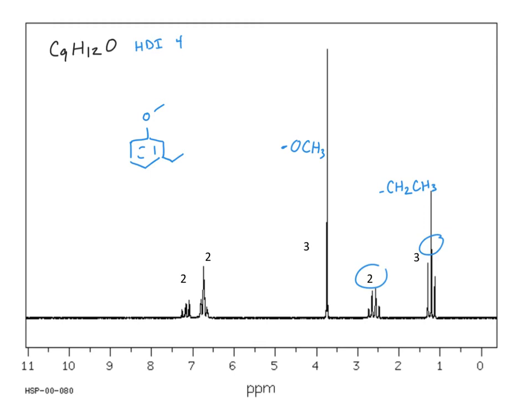It could match the ortho-substituted compound or the para-substituted compound, although in the case of para, the peaks would look cleaner than this. So in a problem like this, you would be given credit for this right answer, of course, but also if you had answered ortho or para, then you wouldn't be discounted any points because the spectrum doesn't differentiate which isomer that you have.